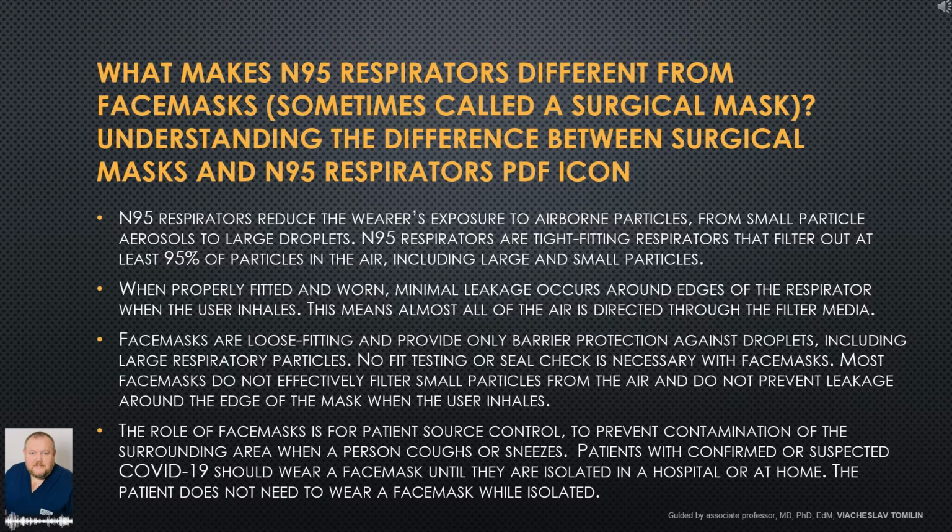Face masks are loose-fitting and provide only barrier protection against droplets, including large respiratory particles. No fit testing or seal check is necessary with face masks. Most face masks do not effectively filter small particles from the air and do not prevent leakage around the edge of the mask when the user inhales. The role of face masks is for patient source control, to prevent contamination of the surrounding area when a person coughs or sneezes. Patients with confirmed or suspected COVID-19 should wear a face mask until they are isolated in a hospital or at home. The patient does not need to wear a face mask while isolated.